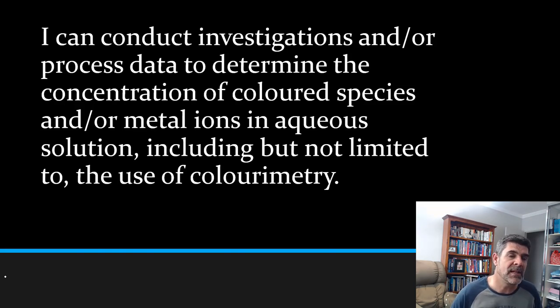But what about flame testing? Is there a way that we can use techniques based on the different spectra in order to turn something that was basically a qualitative identification of ions or colored solutions into something that's a little bit more quantifiable? And of course there is. In fact, there are a number of techniques that are based on the spectra of different atoms.